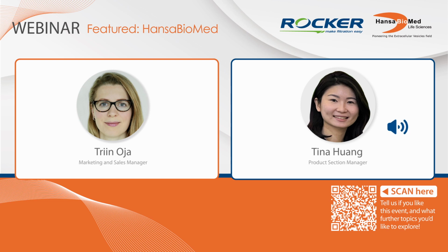We all know that extracellular vesicles play a crucial role in intercellular communication, which is associated with both physiological and pathological processes. And HansaBioMed is dedicated to the research of extracellular vesicles and is a pioneer in this field. So today we are very delighted to invite Triin from HansaBioMed to share her valuable insights into the benefits of TFF in the EV purification. So now let's welcome Triin.